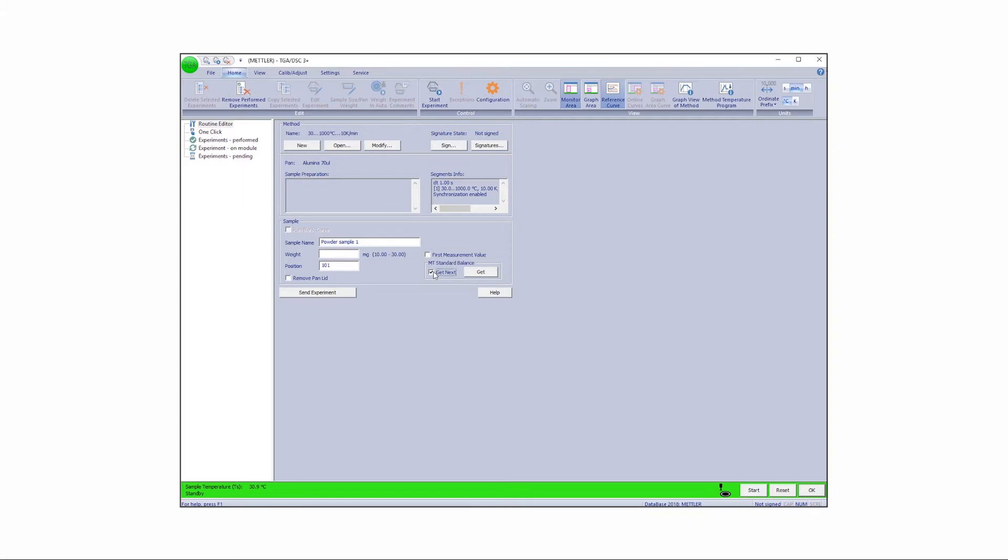Click the Get Next checkbox to transfer the sample weight from the balance to the empty weight field in the Routine Editor.